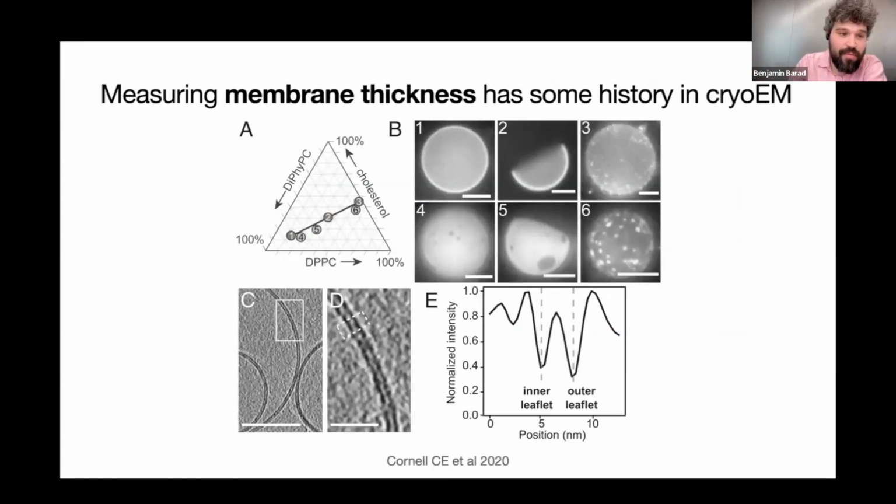I wanted to talk about one more thing before I get into the how part, because this is what I'm doing right now. And it's always more fun for me to talk about what's really exciting me right now, which is to use the membrane segmentation in the model as a sampling tool for digging into the mesh and digging into the density itself.